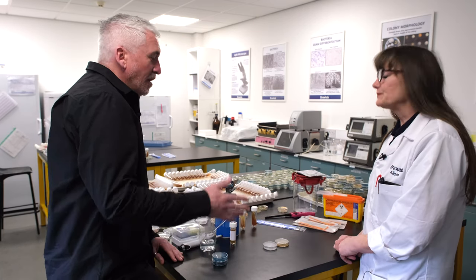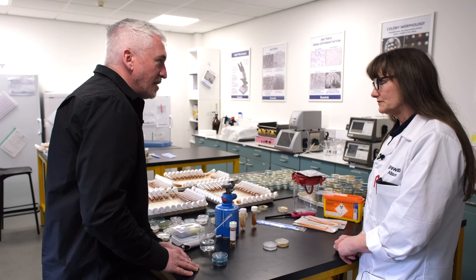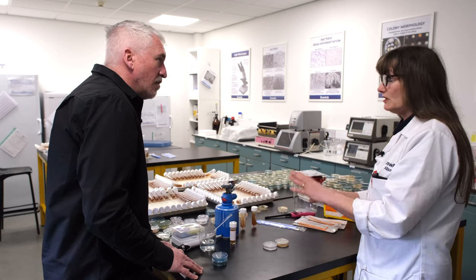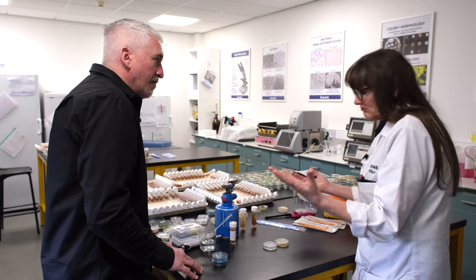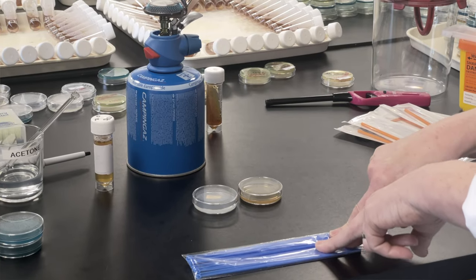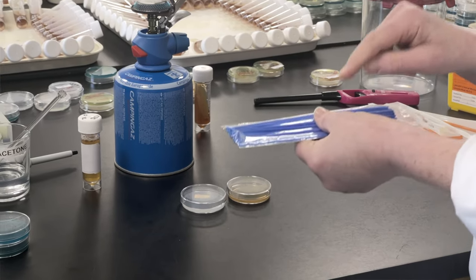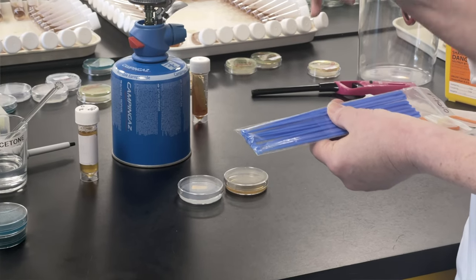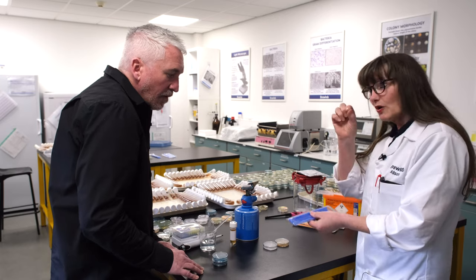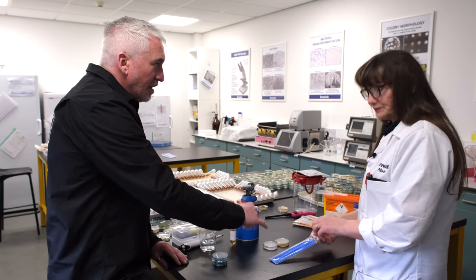At home, you don't need a burner - these are just camping burners. You could work in your kitchen near your gas stove for the same heat protection. What you can buy are sterile loops, which are widely used in home brewing for replicating yeast slopes and things like that. When we used the Gilson and tips, that was 0.1 ml; these loops are 10 microlitres - 0.01 ml. You fill the loop with the product via surface tension and that gives you your volume.